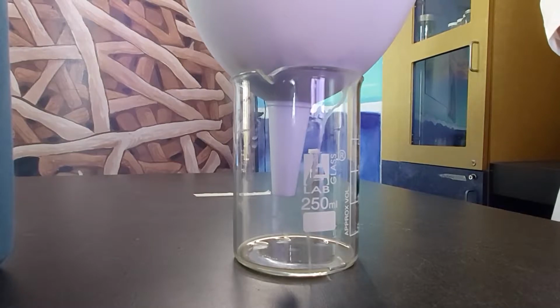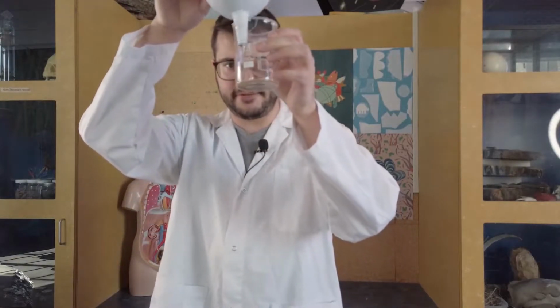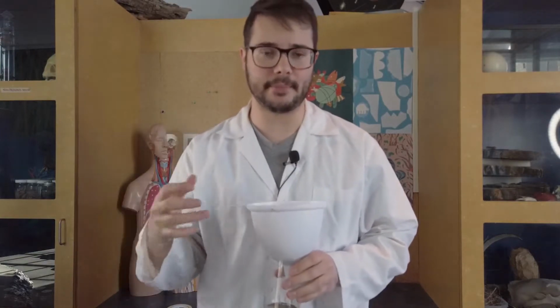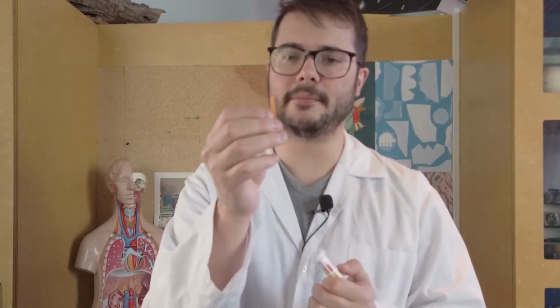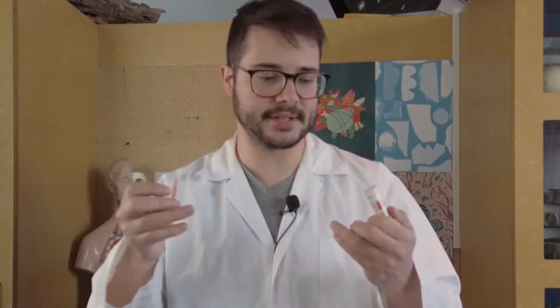All right, so now that we have a little bit of liquid filtered out there, we're going to be testing this by using a piece of litmus paper. So we're going to get rid of this funnel. And litmus paper is a type of paper that is dyed with a whole bunch of chemicals. These chemicals, when they go into a substance of a certain pH, change color and they help us be able to tell what the pH of a substance is.